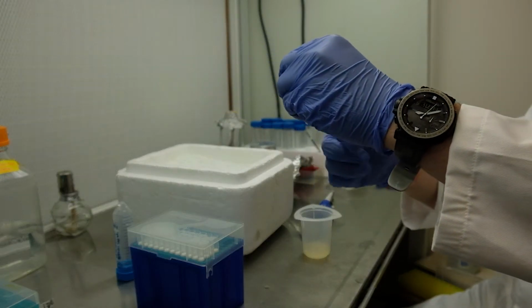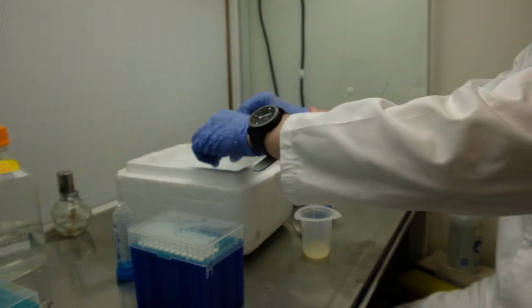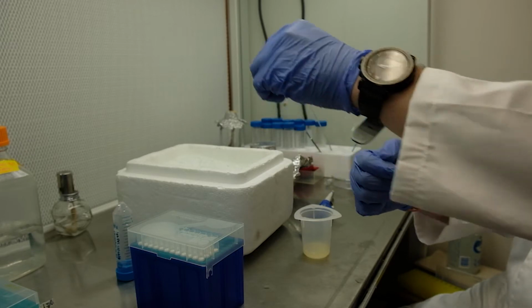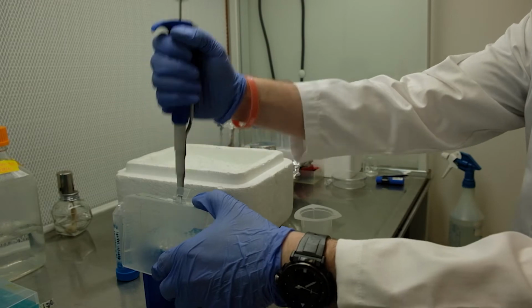Try to gently resuspend by flicking the tube. This usually doesn't work though after multiple rounds of centrifugation. The other option is to resuspend by pipetting up and down.